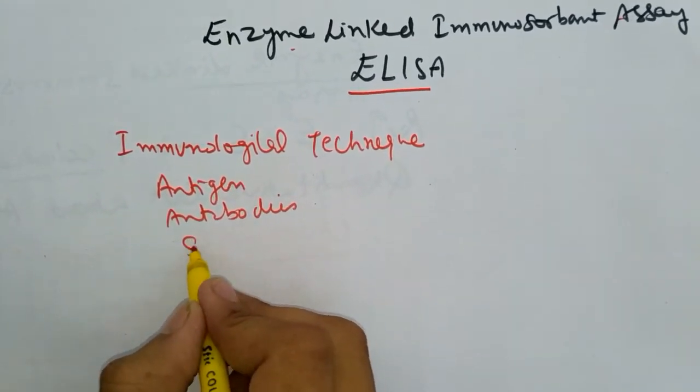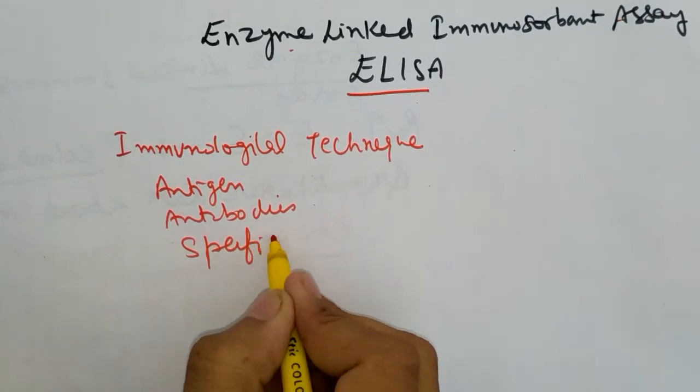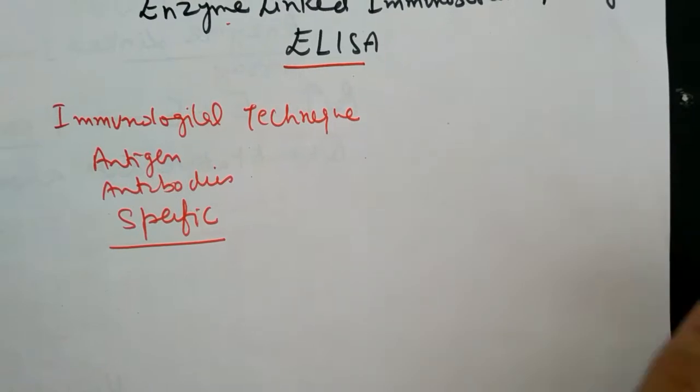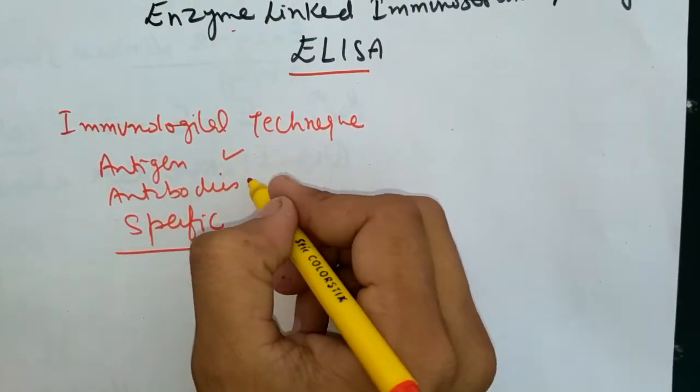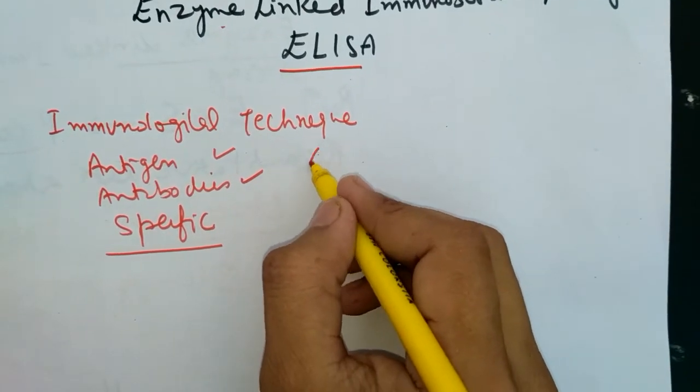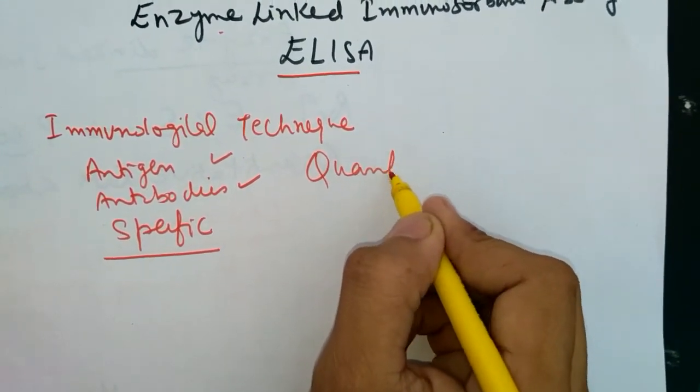It is a very specific type of technique. Here we can isolate a particular antigen and antibody, and also we can study its quantitative level.